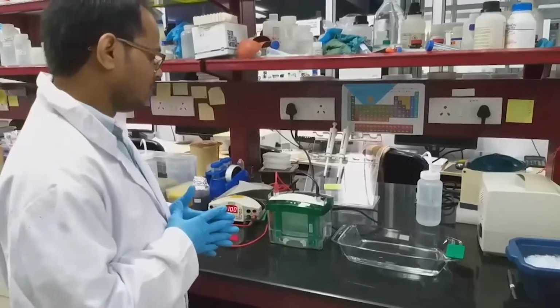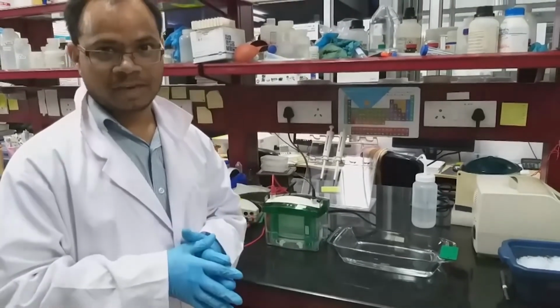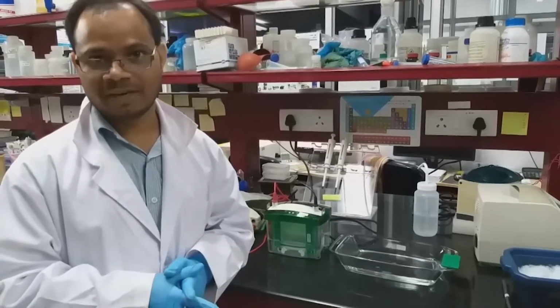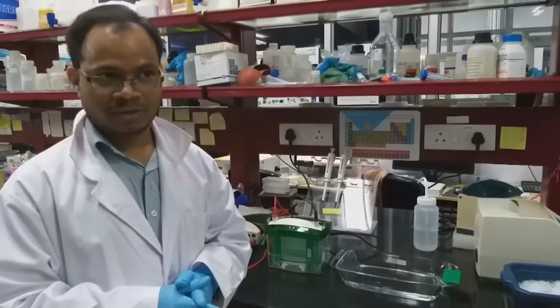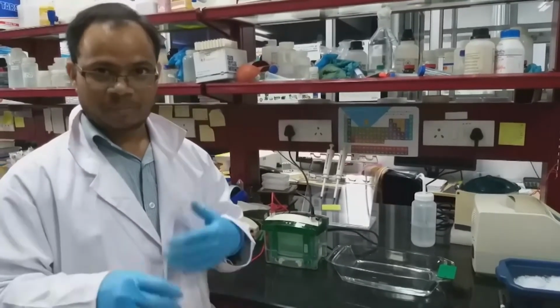Generally there are two ways of staining and de-staining process. One is quick staining, where we heat the gel with the staining solution which contains Coomassie brilliant blue along with methanol and water. Then we de-stain with water by heating.